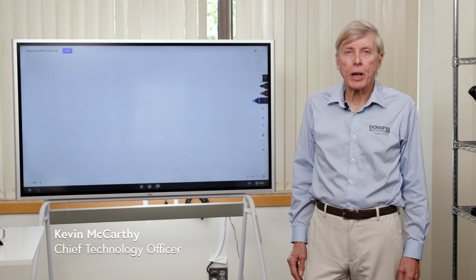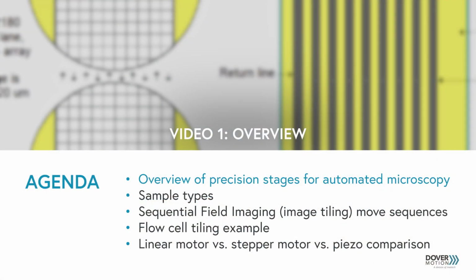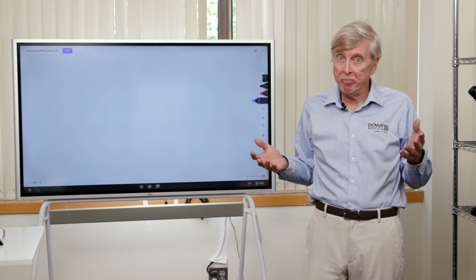Hi, I'm Kevin McCarthy, and in today's video we're going to be looking at the precision motion aspects that enable high throughput microscopy. Now, it's worth taking a moment to distinguish high throughput microscopy from the alternative. There's sort of two basic things that can happen.